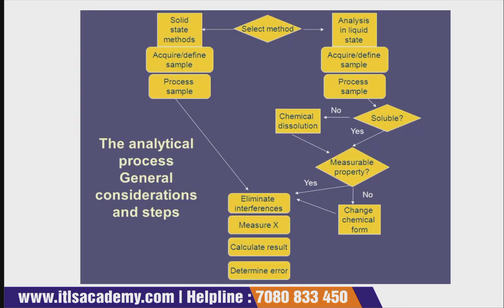Okay, now let's quickly see this as an analytical process, general consideration steps. For example, the first one, you have to select the method that I have just told you, for solid state method, or if you want to analyze any liquid state. Depending on whether it's a solid or a liquid, you have to define the sample. Then the processing of the sample takes place.